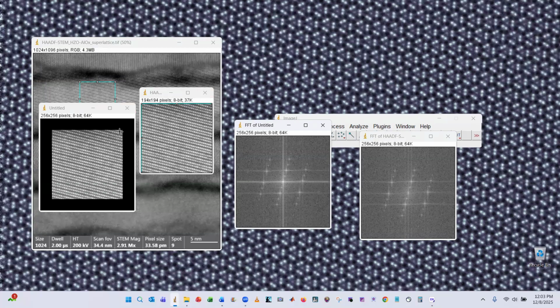That's very possible. I don't know that for sure. But we have these hard edges here, right, where it goes from image to 0. And so that's probably why we're seeing the enhanced cross-shaped artifacts when we manually pad the picture like this, okay? But in essence, it's doing the same thing, okay? So now the neat thing here is that you can make this reduced area any shape you want, okay?